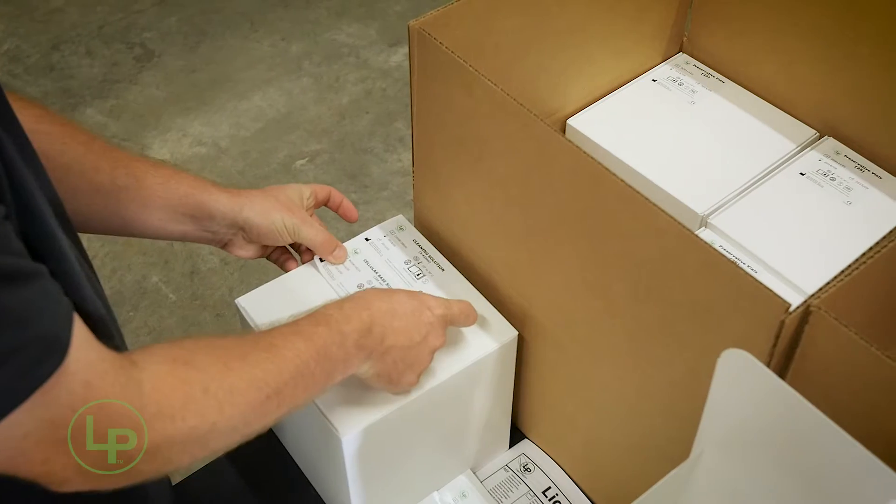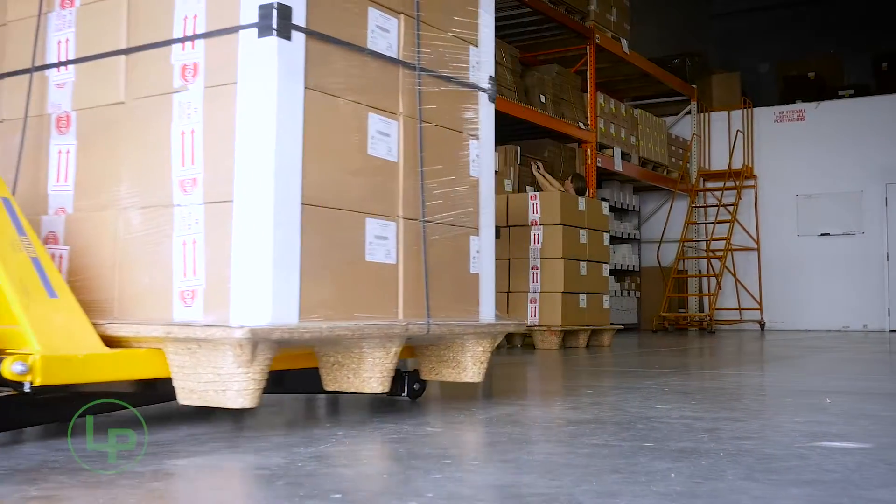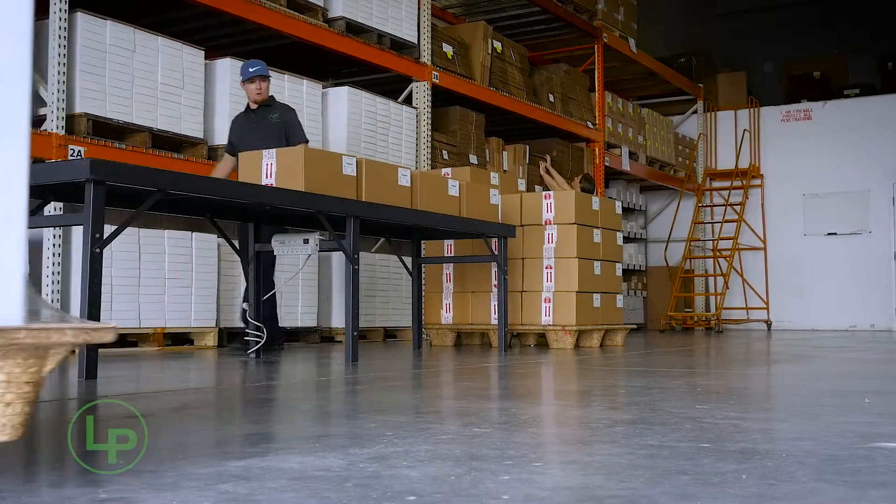LiquiPrep reagents and our Auto LP instrument are shipped worldwide.